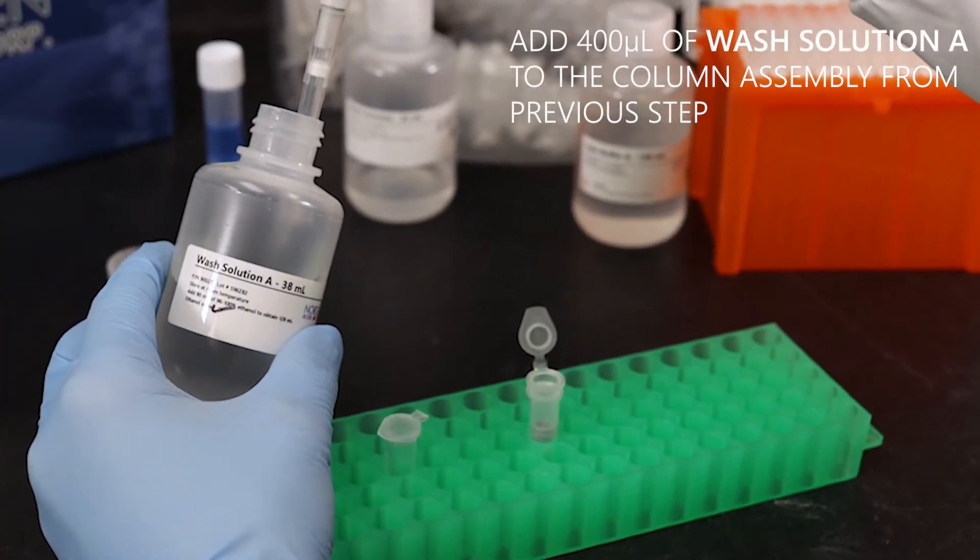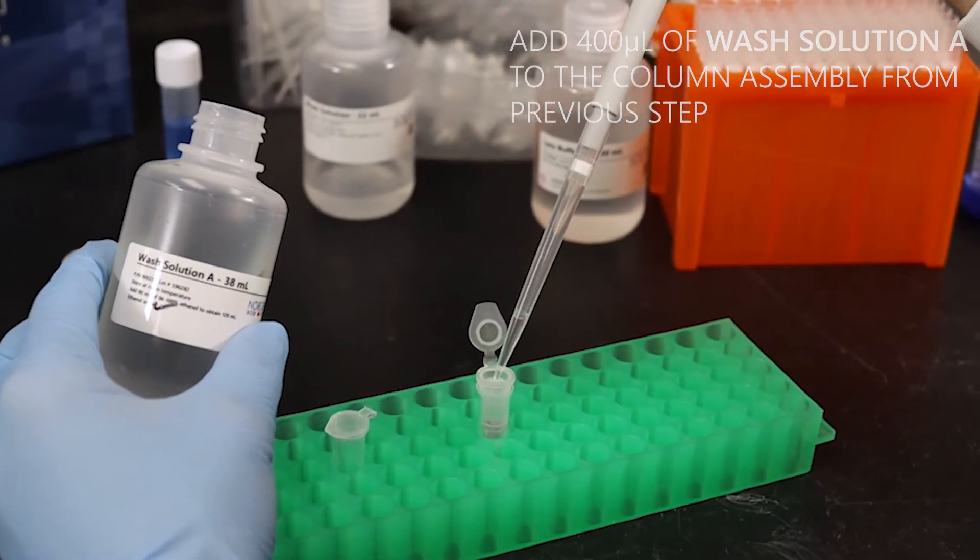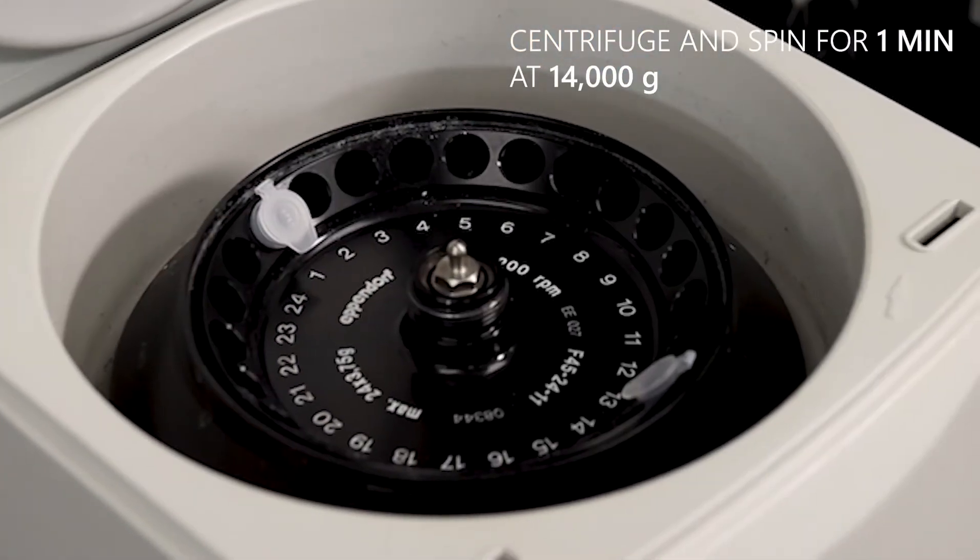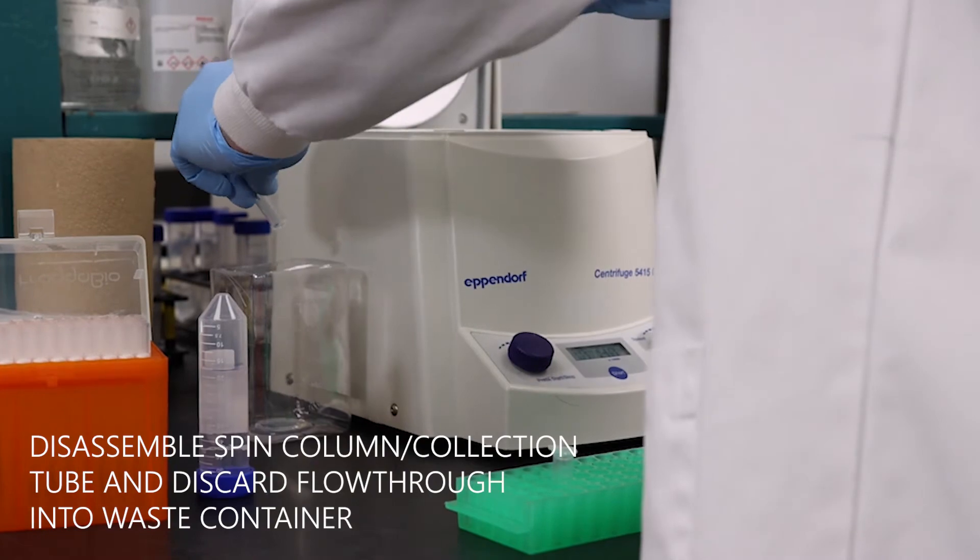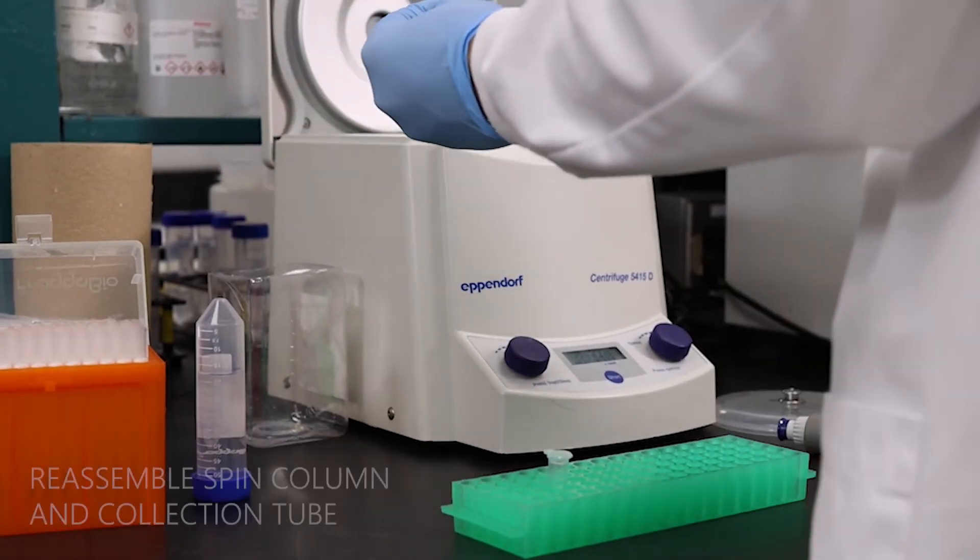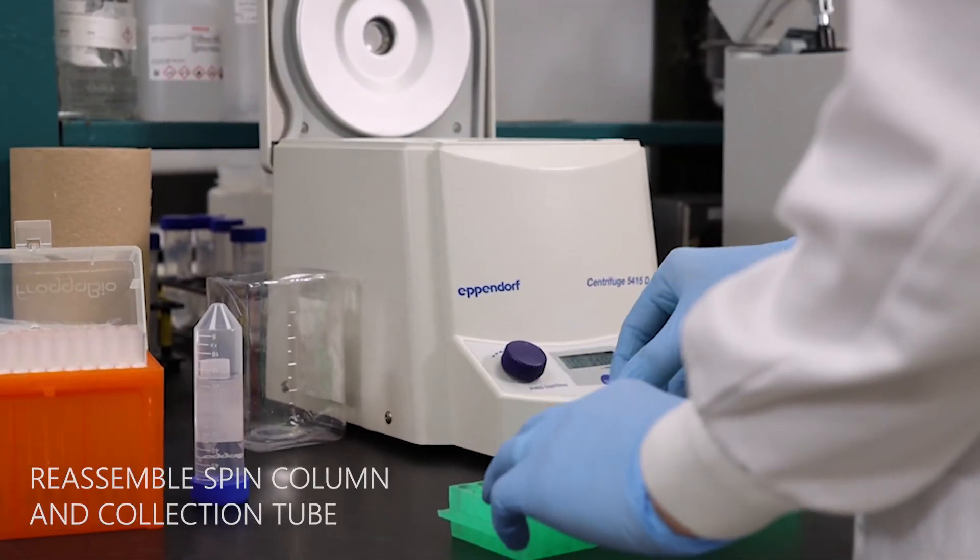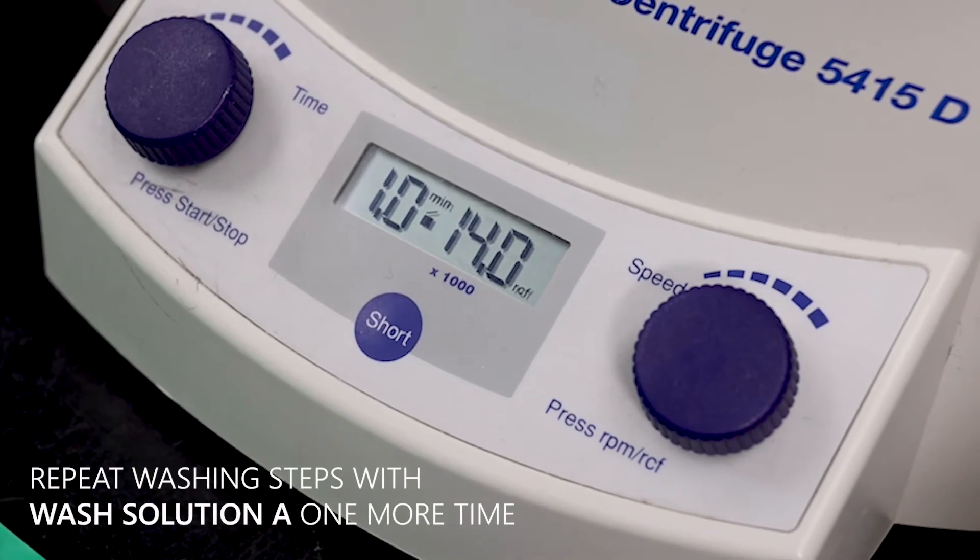Next, add 400 microliters of Wash Solution A to the column assembly. Centrifuge for 1 minute at 14,000 G. Discard the flow through into a waste container. Reassemble the spin column and collection tube. Repeat the wash step with Wash Solution A.